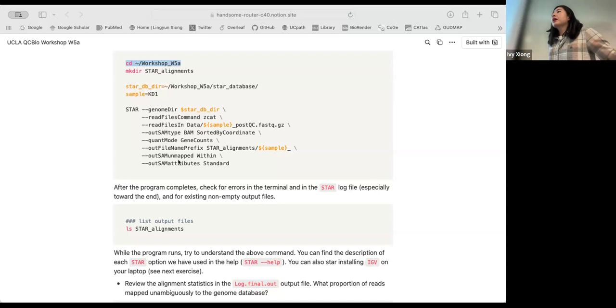For single cell analysis, typically you will use 8 GB RAM at least. Sometimes you have to scale it up to like 64 because the computation is more intense. How much are you allowed to use, max? I don't know about Hoffman2, but I used to run to the ceiling of 96.